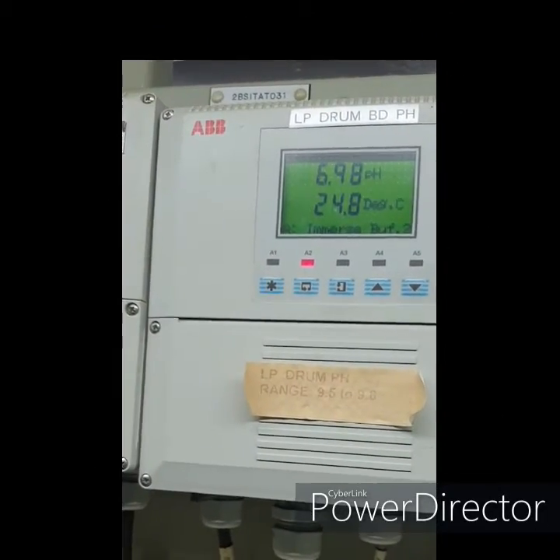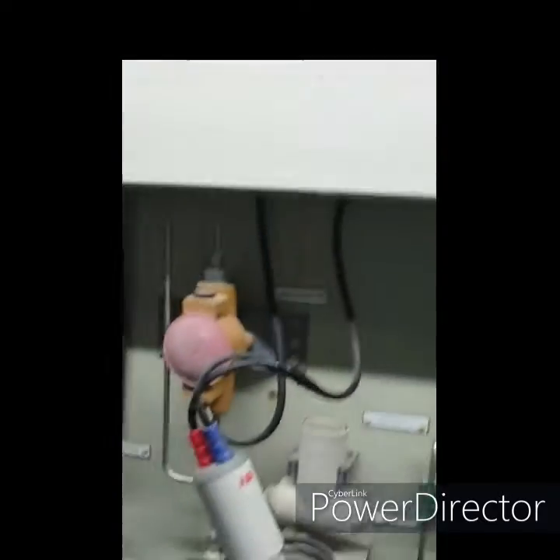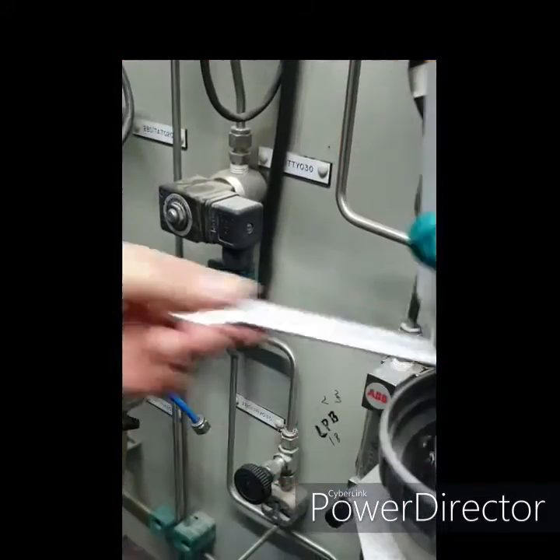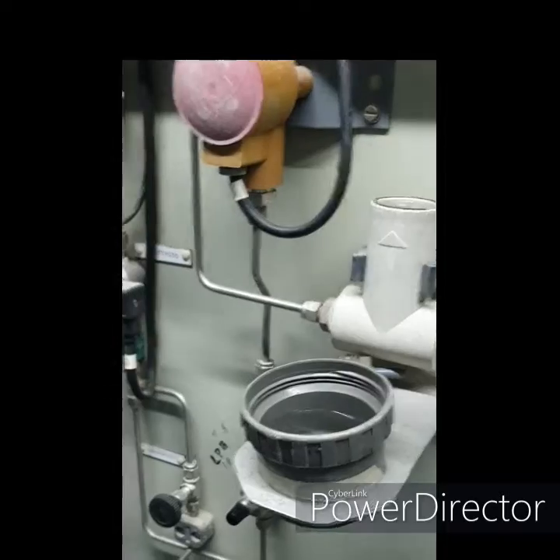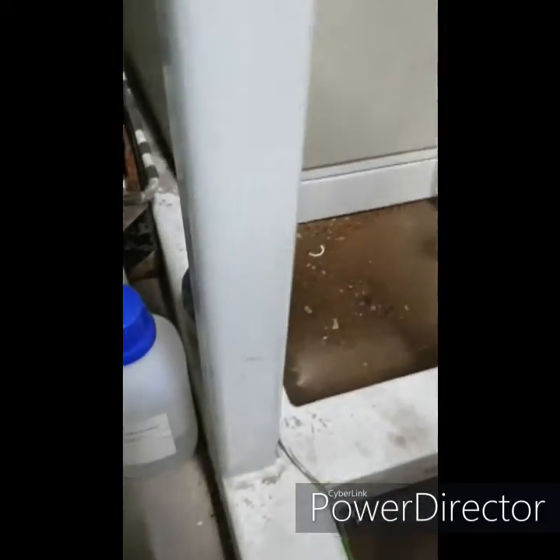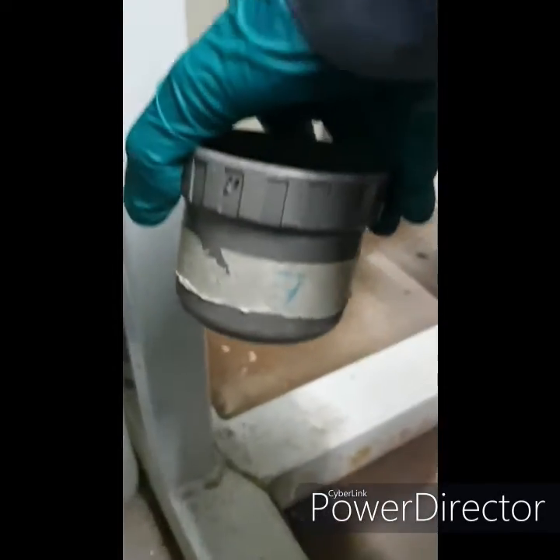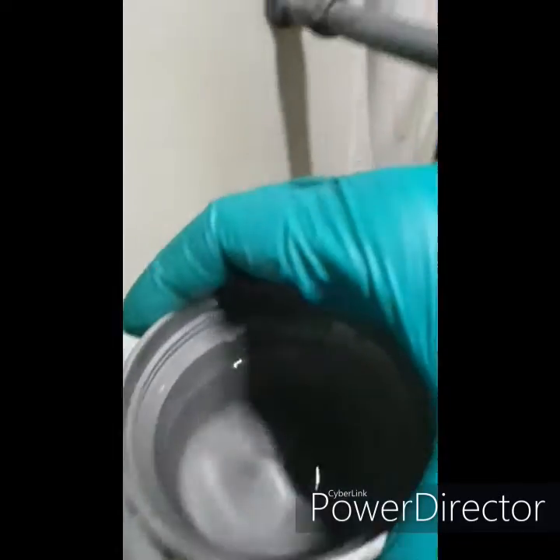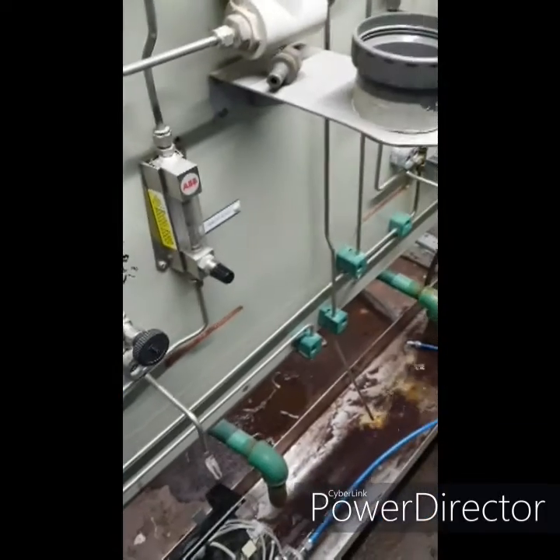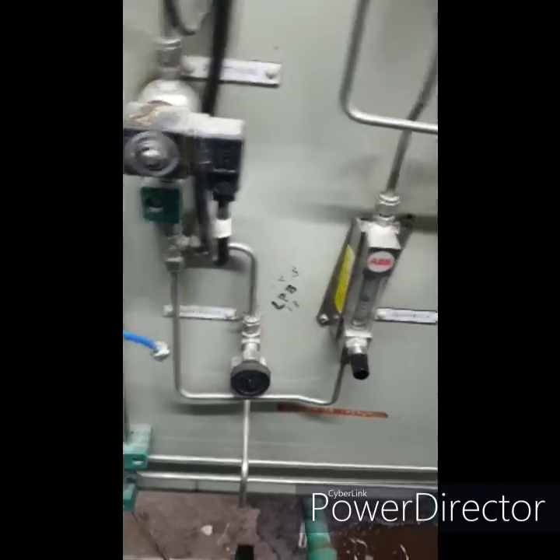Buffer 1 is done. It is now asking to immerse buffer 2. We will get buffer 2, but first we have to clean the sensor. This is buffer 7 pH. But first we will clean it with water.